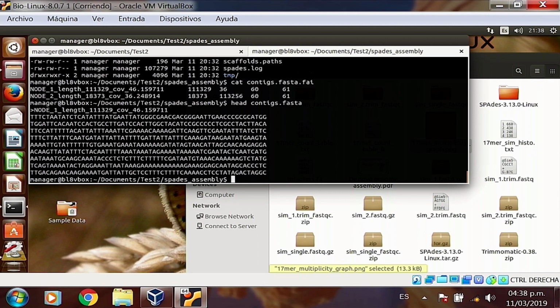For every sequence you have a name, then a sequence of 60 base pairs, and then an enter, and then the second line, third line, etc. Each of these lines have 60 base pairs. But the length of the line is 60 plus 1 that you cannot see. It's the new line, the enter. It needs to be stored anyway. So that's why the length of the line is 61, but the length of the sequence is only 60.